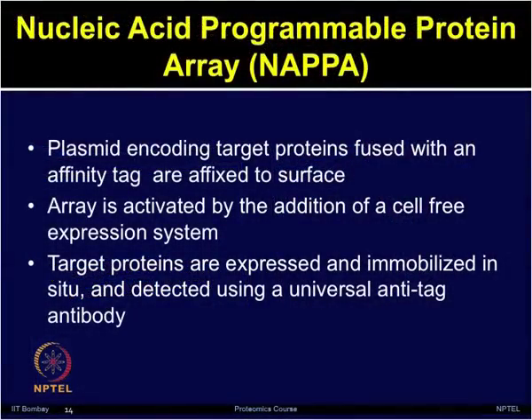So, let us discuss the principle of nucleic acid programmable protein arrays, how these arrays are generated. Plasmids which encode target proteins, fused with an affinity tag, are affixed to the microarray surface. The microarrays are activated by the addition of a cell-free expression system, generally rabbit reticulocyte lysate.